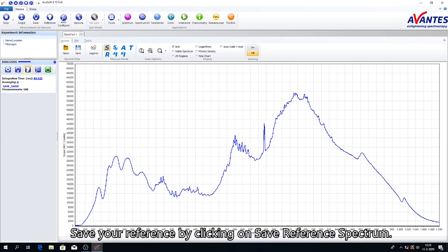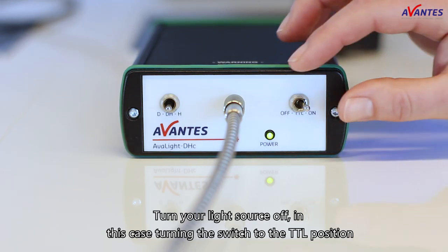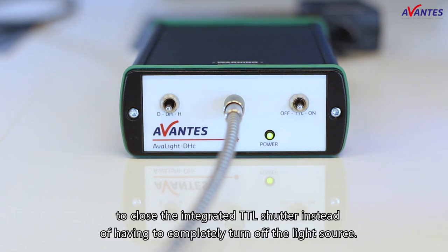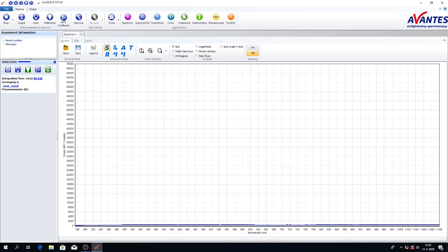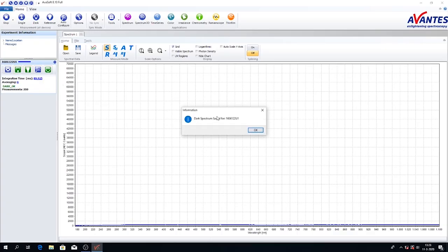Save your reference by clicking on Save reference spectrum. Turn your light source off. In this case, turn the switch to the TTL position to close the integrated TTL shutter instead of having to completely turn off the light source. Take a dark reference by clicking on Save dark spectrum.